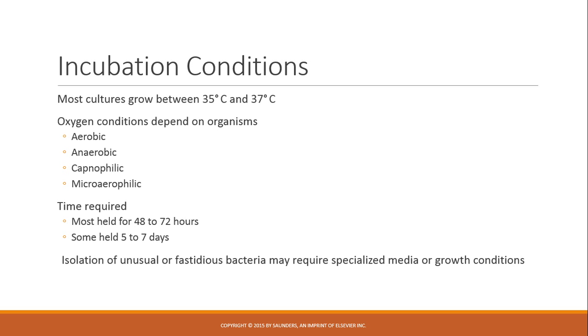Capnophilic: you may have a CO2 incubator that pumps CO2 into the incubator, or you can use a candle jar, where you put the plates in a jar and put a candle in there and light it and seal it up, and the candle will convert all the oxygen to CO2. And then a microaerophilic chamber will have a decreased amount of oxygen present in it.